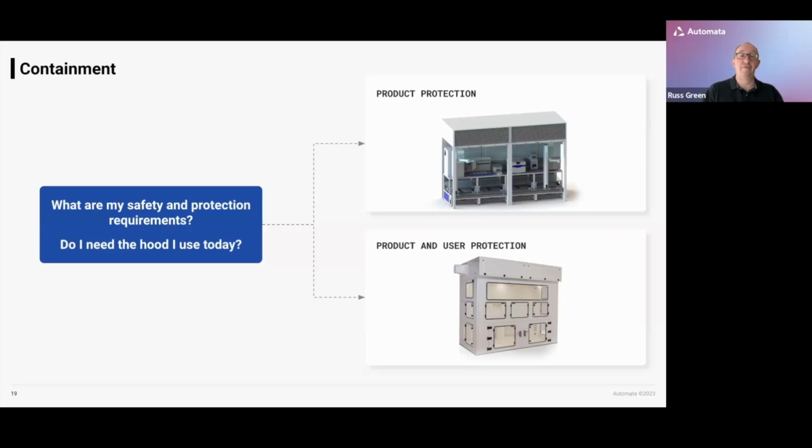I'd say around half of the enclosures we spec are of this type, but you can immediately see we're building a much larger box around the platform, and we have to compromise in some other areas, and perhaps we do start turning the system into a bit more of one of those large monolithic systems. And we have to think about how we're going to test for that and make sure we drive good adoption of it. But again, these are all solutions that have to be specified as part of the solution development process.